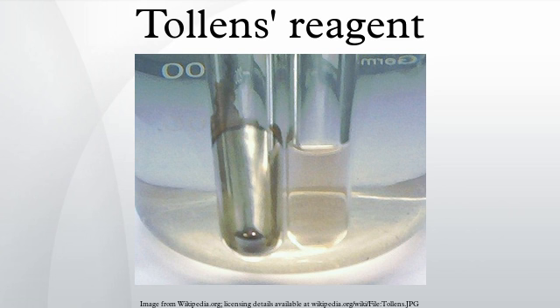The diamminesilver(I) complex in the mixture is an oxidizing agent and is the essential reactant in Tollens reagent. The test is generally carried out in a test tube in a warm water bath. In a positive test, the diamminesilver(I) complex oxidizes the aldehyde to a carboxylate ion and in the process is reduced to elemental silver and aqueous ammonia.